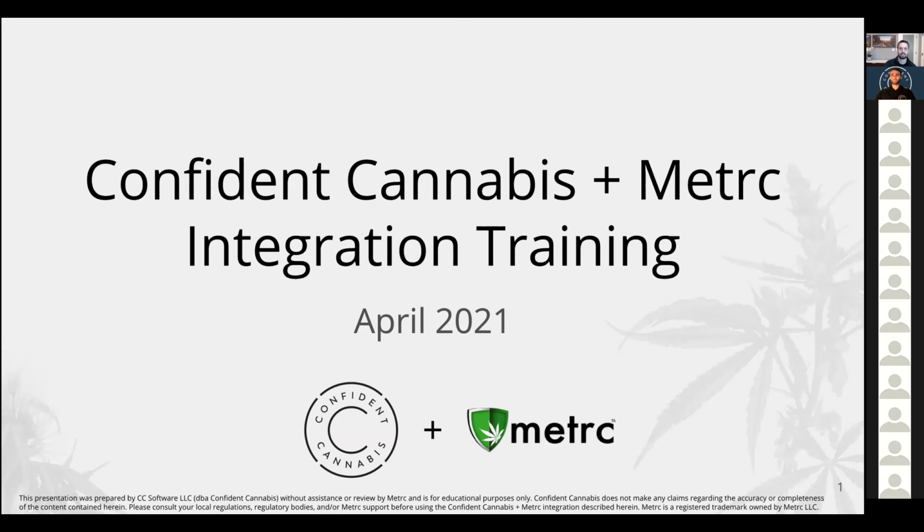Today, we're discussing the Confident Cannabis plus Metrc integration. As many of you know, Metrc is being rolled out in Oklahoma and across the country bit by bit. Confident Cannabis has built an integration with Metrc to greatly streamline your laboratory workflow and save you several hours of manual entry and potential errors.